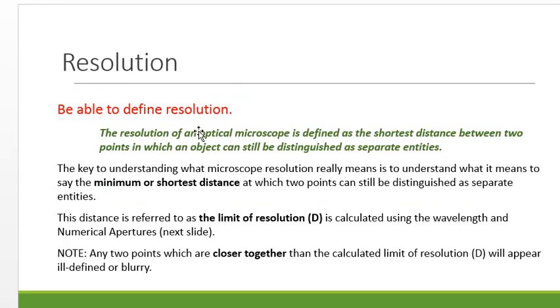Another terminology, make sure you understand why we use the microscope. It's to help us with resolution, okay? And that means that we're able to take that minimum distance and still distinguish between two points.